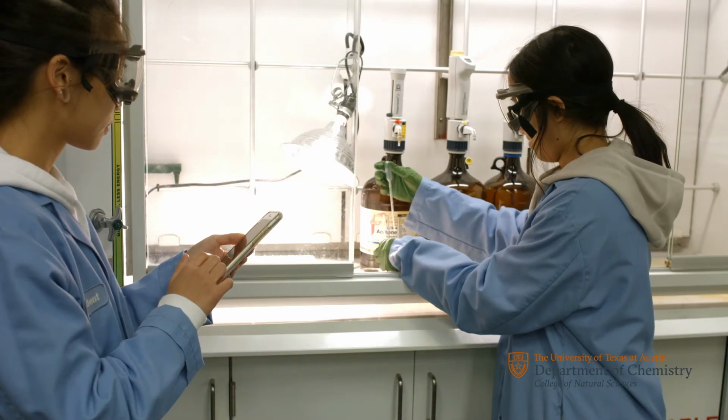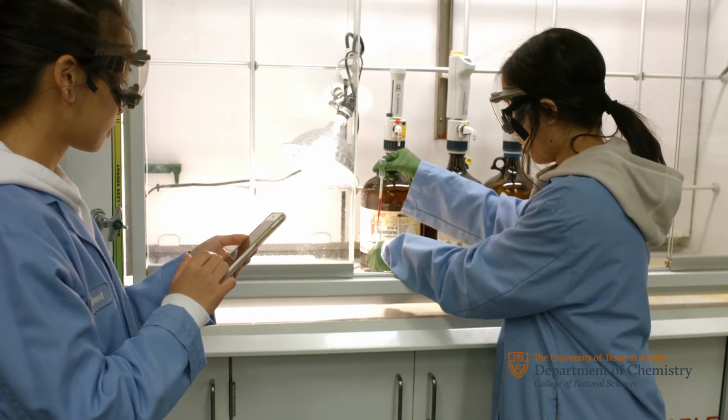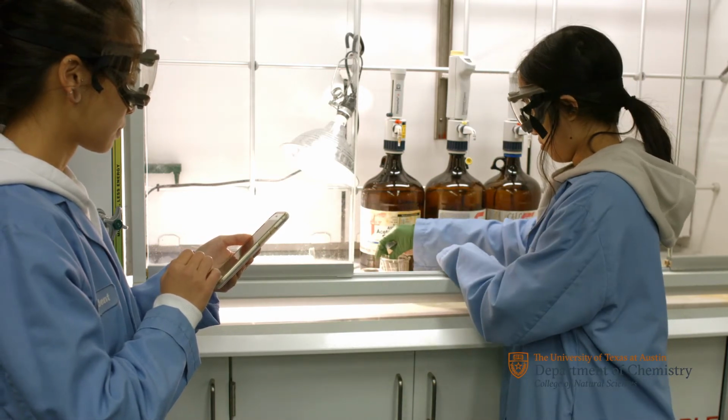Now with your partner, carefully add 0.5 milliliters of bromine to each test tube. Place the test tube in the rack in front of the light bulb and record how long it takes for the red color to disappear.